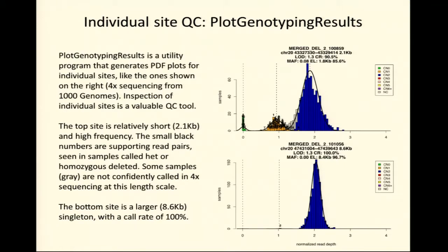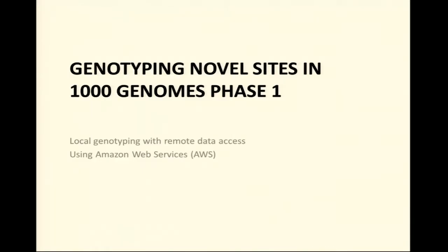So this is a very nice tool to go through site by site. If there are sites that failed filters and you want to take a look and see maybe why they failed, or if you have a particular site of interest, these plots are really useful.